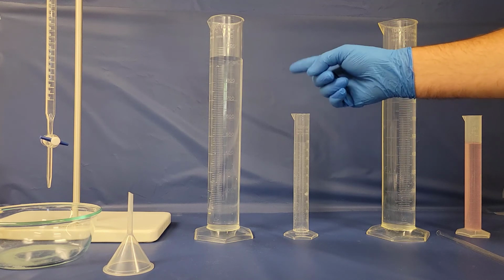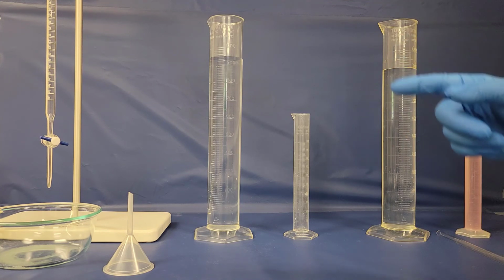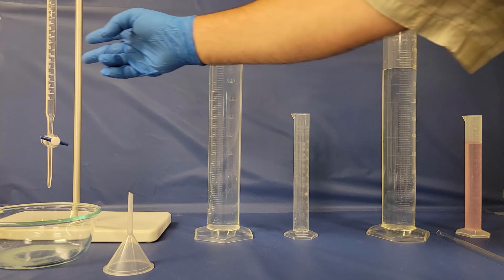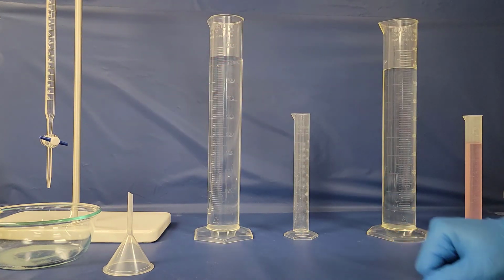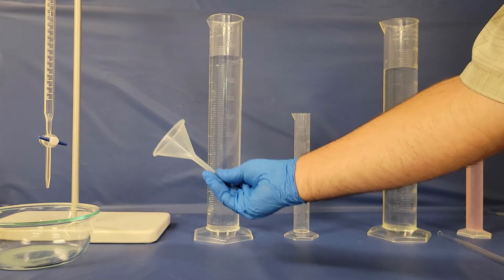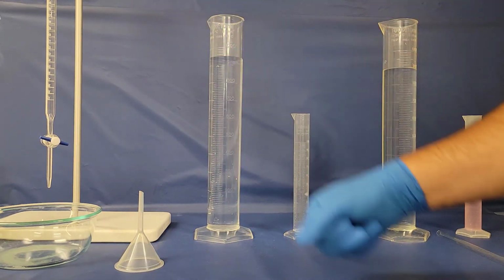Once we have our acid solution from the second graduated cylinder here, that's what we're going to be mixing with our irrigation water to develop the titration curve. Over here we have our burette, which has fine resolution and allows us to adjust how many milliliters we drop into our irrigation water. We also have a funnel here, which we're going to use to get the acid solution into the burette.